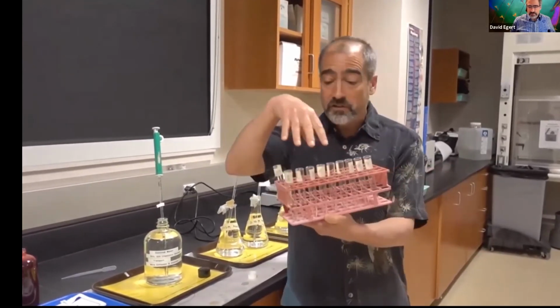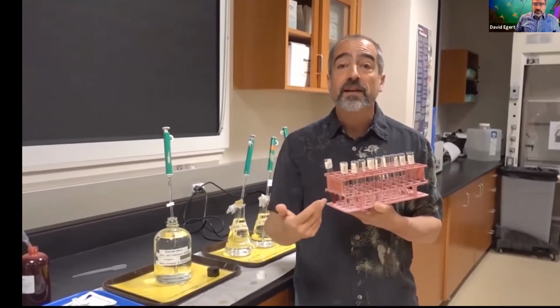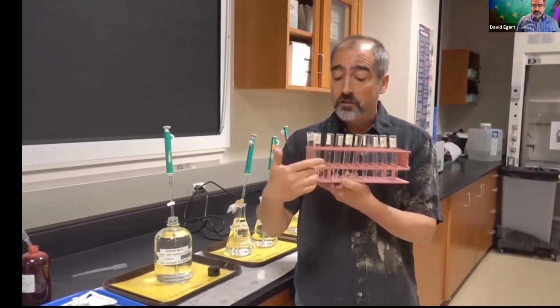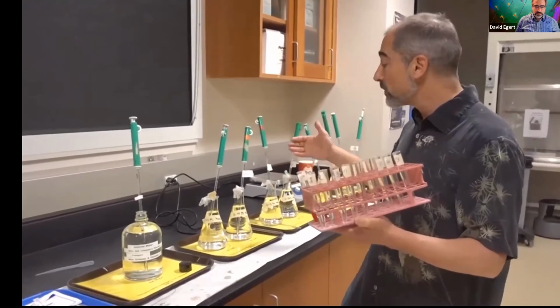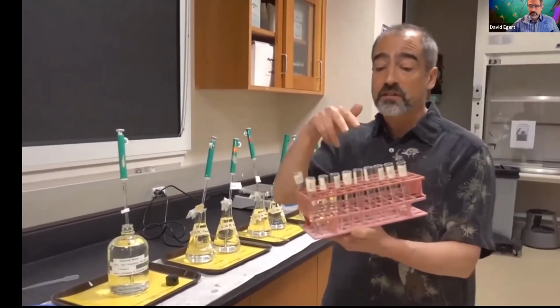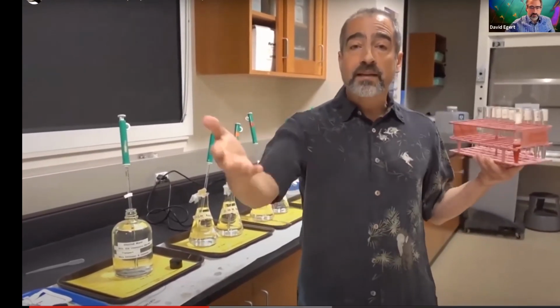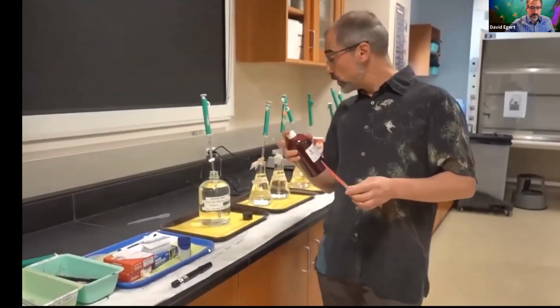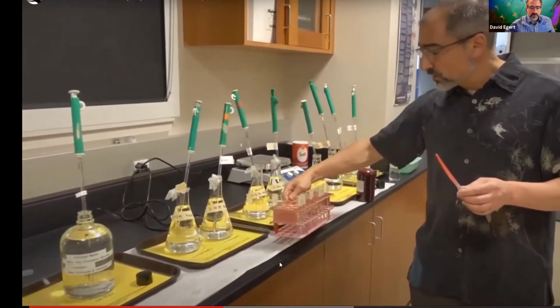And Tina will talk more about the balancing, but part of the balancing is making sure each of your tubes has the same volume. So what I'm going to do is put 0.3 mils of each of the appropriate solutions into their appropriate test tubes, and then we will come back in a moment. Good. All right, so we have each of the test tubes with the appropriate solution.